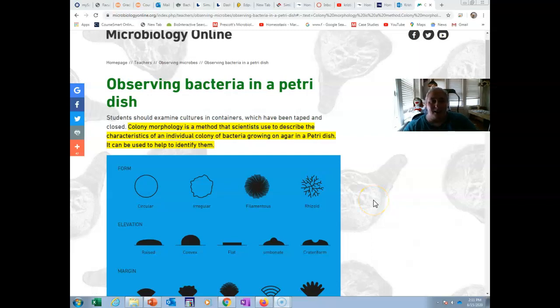Hey there, everybody. This is going to be a short video talking about colony morphology, just so you are prepared for lab. I'm using this website. This is not my website, but they have colony morphology explained relatively well.